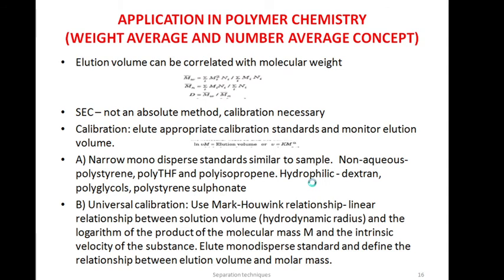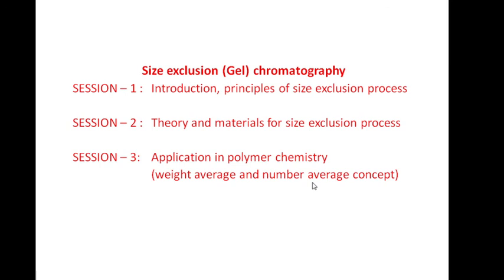So we have covered so far in session 1 the introduction and principles of size exclusion chromatography, in session 2 the theory and materials for the size exclusion process, and in this session the application of size exclusion or gel chromatography in polymer chemistry. So that completes size exclusion chromatography. I hope you have understood.